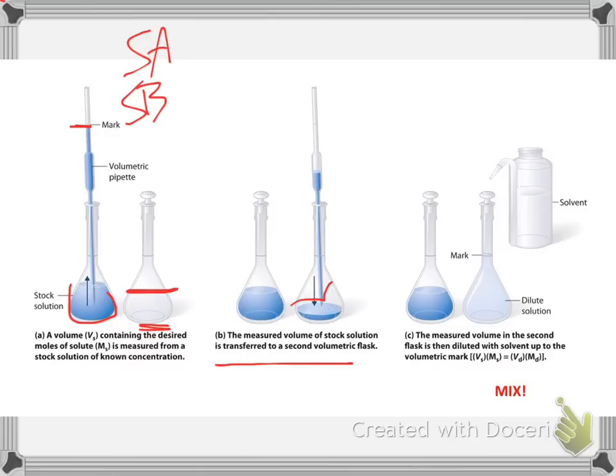Okay. If I'm just making a dilution from a standard solution and it's not a strong acid or a strong base, I can go ahead and put that stock solution in first. And then I'm going to fill up to the line using my wash bottle or my flask, depending on how much, or my beaker, depending on how much water I'm using, all the way to the line. Okay. It's important then that I mix.